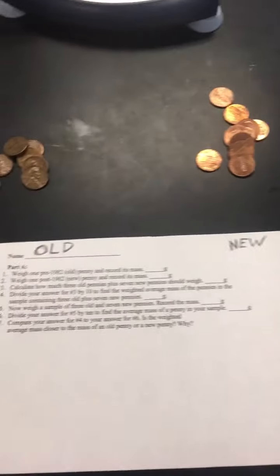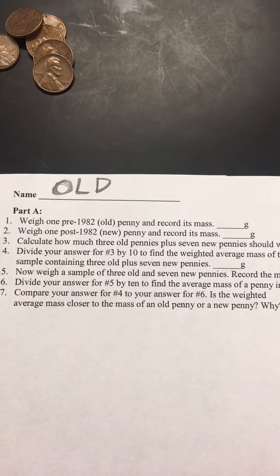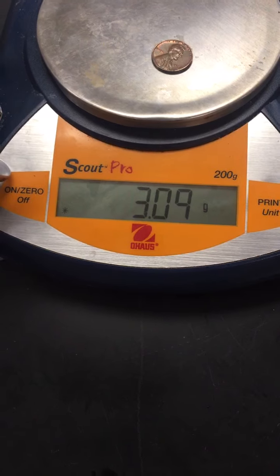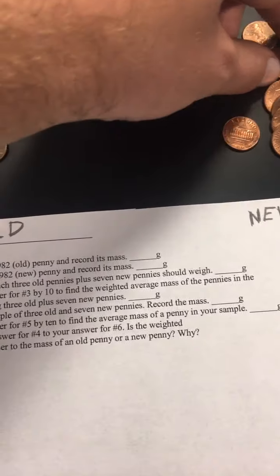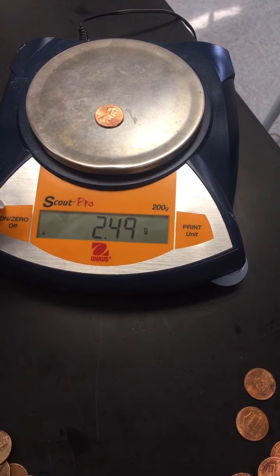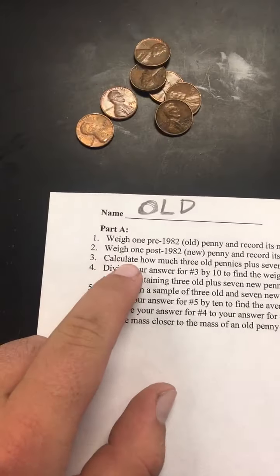To start off, it says weigh one old penny and record its mass. I've got my old pennies up here. I'm going to put one on the scale. It weighs 3.09. Number 2 says weigh one new penny and record its mass. It weighs 2.49.